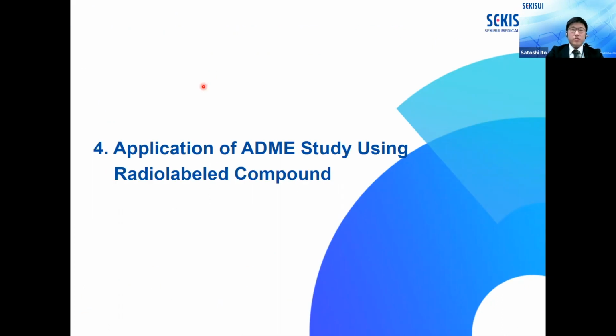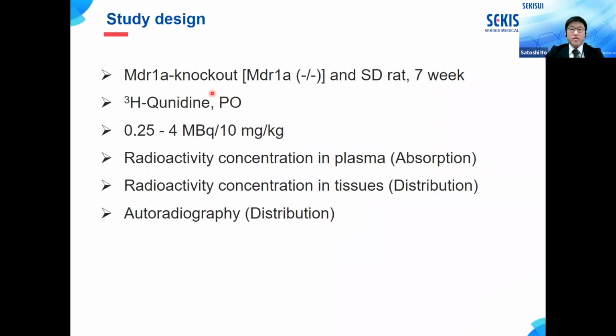Next, we show an application of ADME study using radiolabeled compound. The purpose of this study is to assess the function of MDR1 transporter using quinidine on both SD and MDR1A knockout rats. Quinidine is a typical substrate of MDR1. We are performing three studies, and those are the absorption study and two distribution studies.